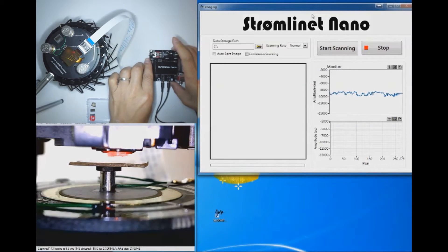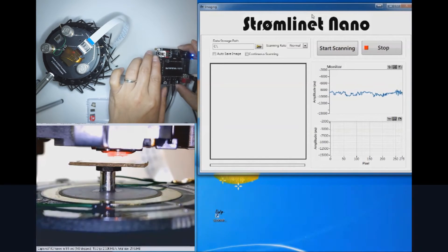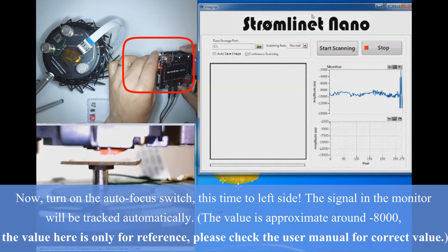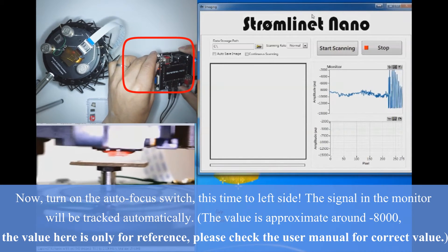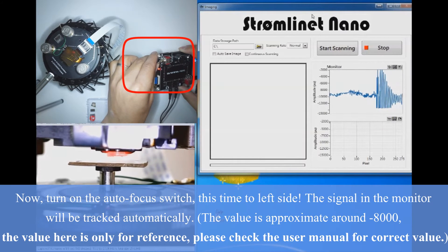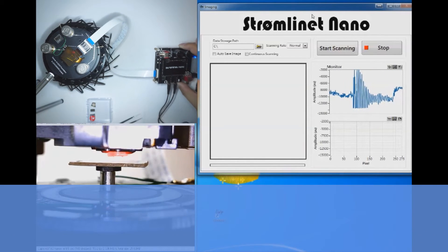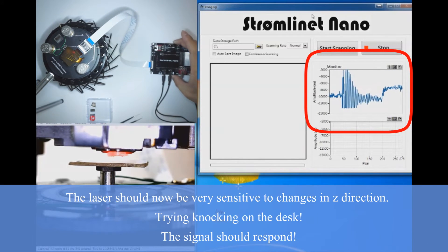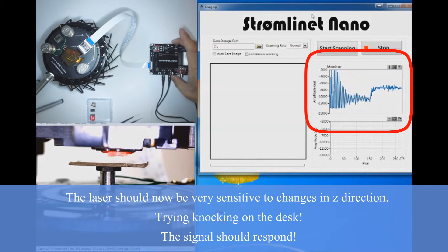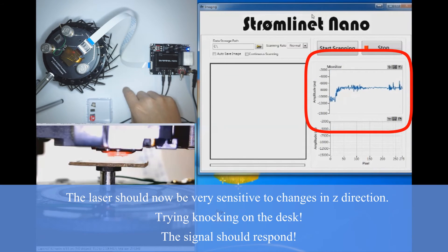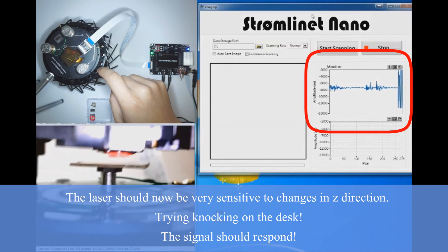OK, now we're ready. Let's turn on the autofocus by flipping the switch to the left side in this example. You'll see that the signal is now very sensitive to changes in the Z direction. Try tapping on the desk. See all those spikes?